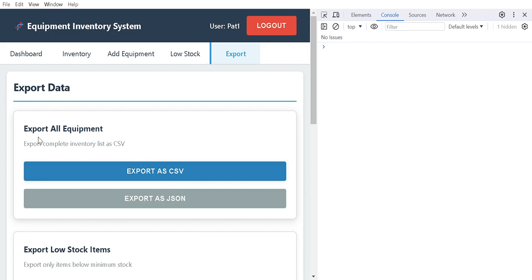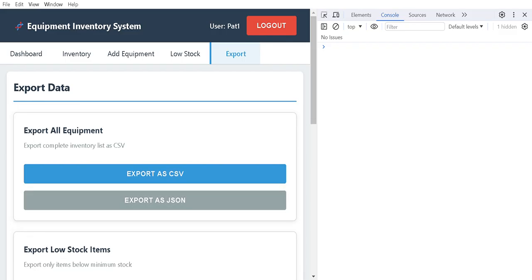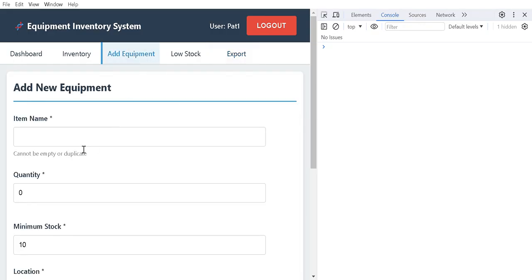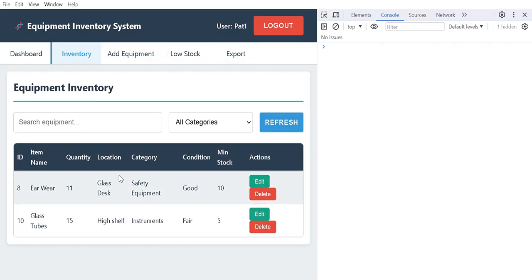You can see it creates a file name. Save. And now it's added to my files folder. And if I were to have opened it up, you would see that it would be a new file that would display the information in my inventory.